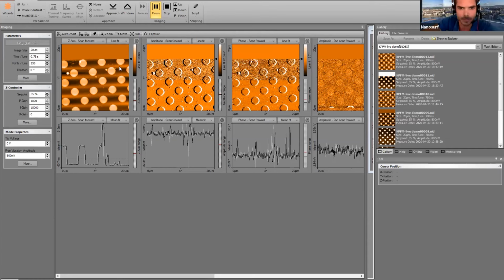Follow-up question, but we can couple blue laser, I assume. I'm not sure what's meant by couple, but I would say yes. Okay.